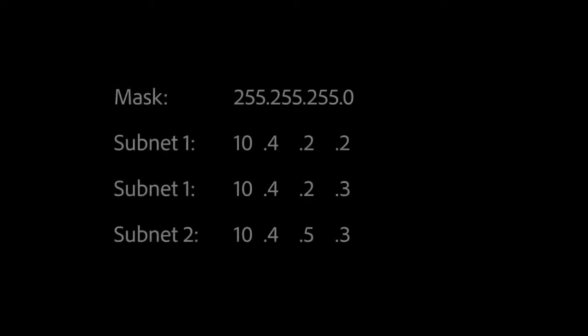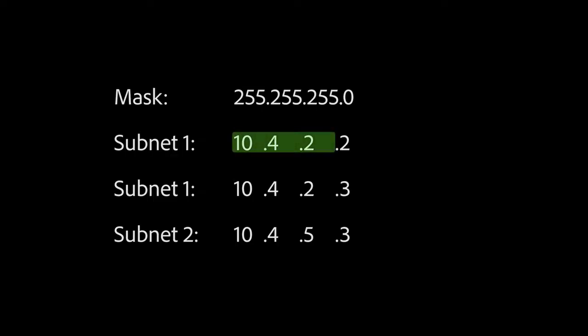If using static addresses, the IGGY or NEWT must be configured to be on the same subnet but have a different IP address than your computer. This means that where the subnet mask bits are set, the IP addresses must be the same, but in the other part of the IP addresses, there must be a difference. For example, with a subnet mask of 255.255.255.0, the IP addresses 10.4.2.2 and 10.4.2.3 are on the same subnet, but 10.4.5.3 is not.